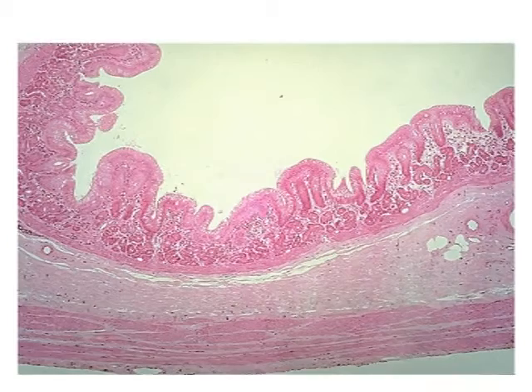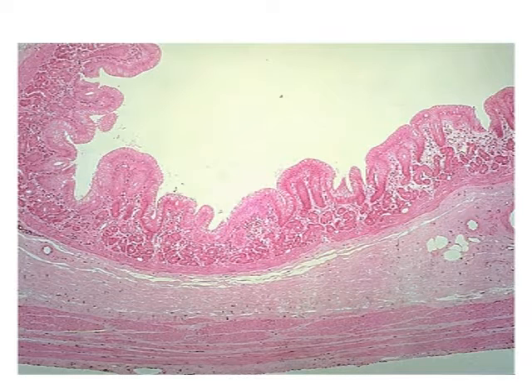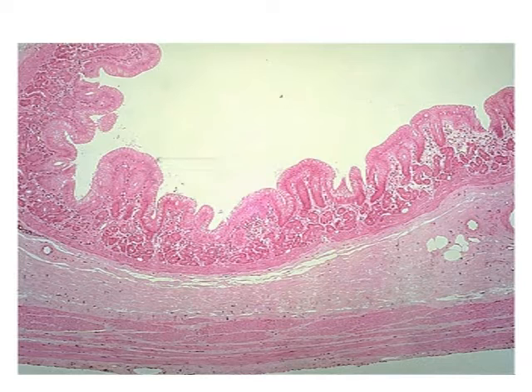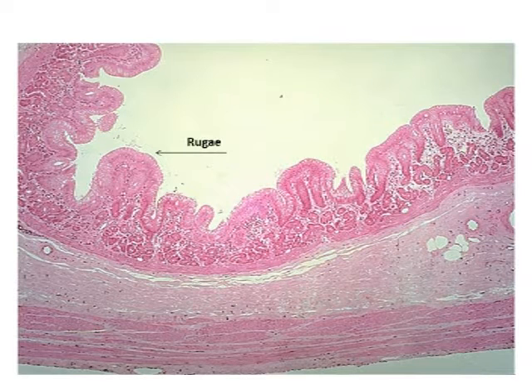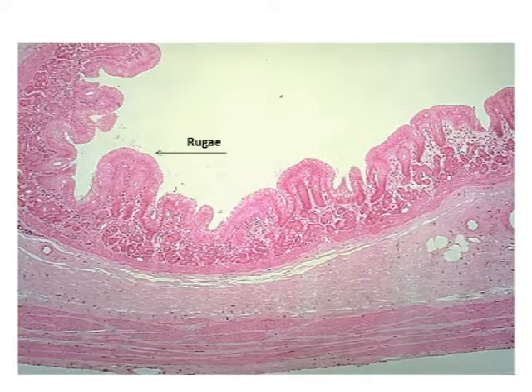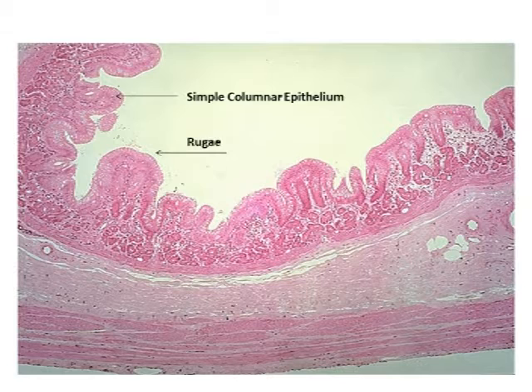Next we're going to go over the slides of your stomach fundus and the duodenum of your small intestines. This is a slide for the stomach fundus. First is the rugae. For the rugae, it is the individual fold that it's pointing to — that's one individual fold. There are several others and they all together are the rugae.